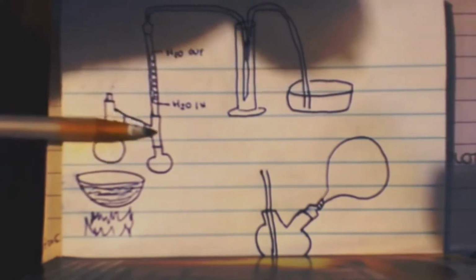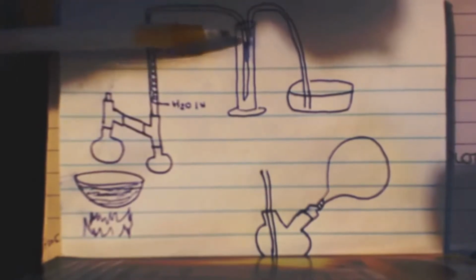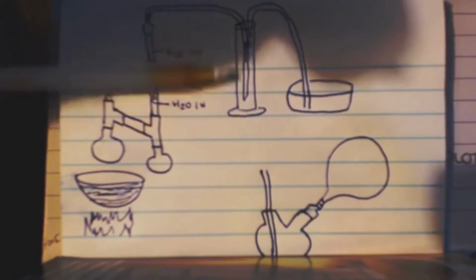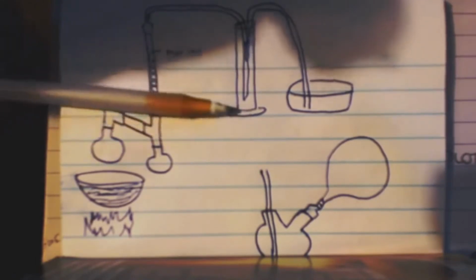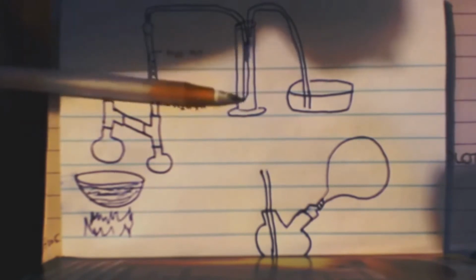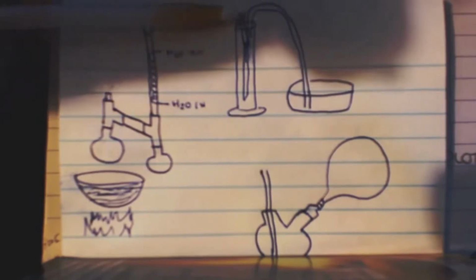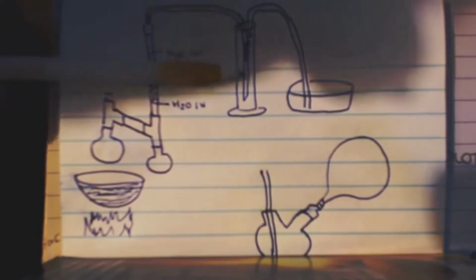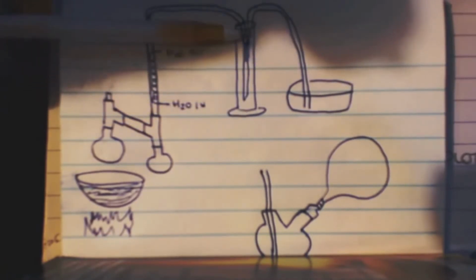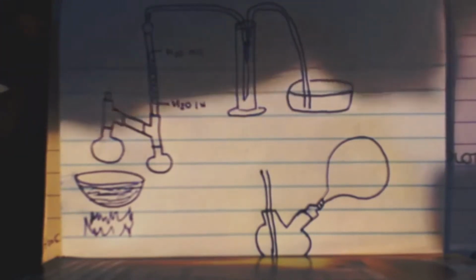As you heat it, your carbon dioxide will come up. It's not going to be condensed, obviously. Put it through here. You see this graduated cylinder? I would put some kind of drying agent in there, like calcium chloride or magnesium sulfate, some kind of drying agent. Even anything. And I would cap this off, right? And your gas comes in, goes to the bottom, and then it has to travel through all that drying agent before it comes up to this tube, comes out, and then you can bubble it into your product.